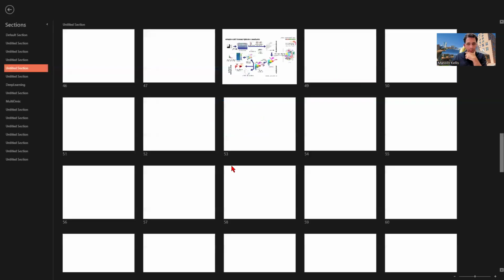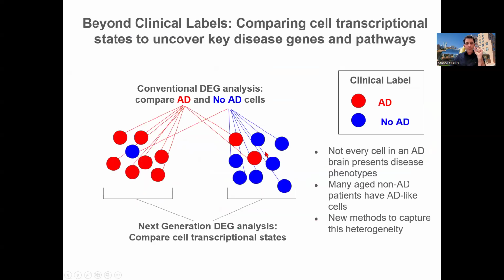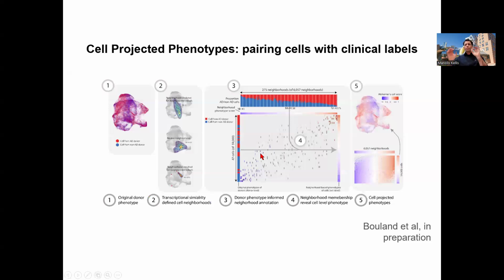So one last analysis type that I want to mention is that in addition to this differential expression analysis, which basically says, I've now grouped all of the cells that I call microglia separately from all of the cells that I call excitatory neurons, or microglia subtype 12, for example. What you can do is actually start studying individual cellular neighborhoods. And brace yourselves, because this might blow your mind.